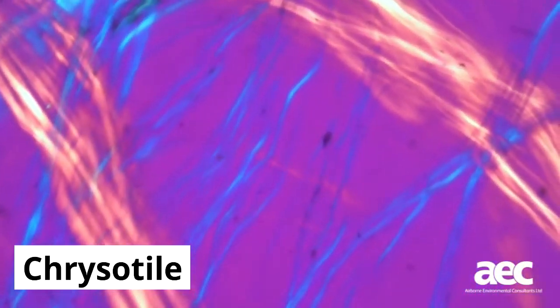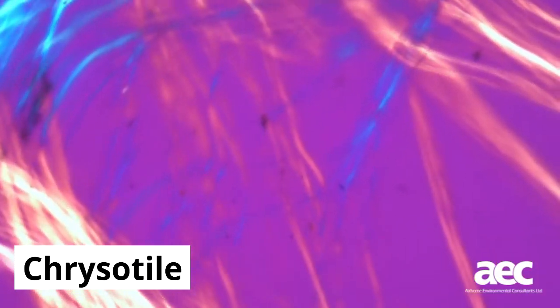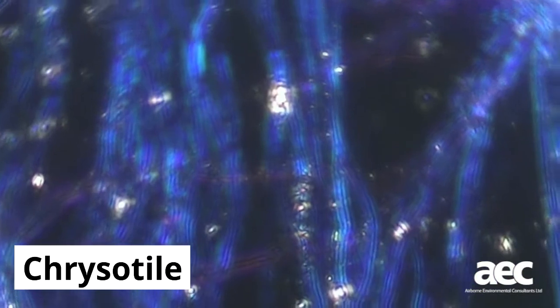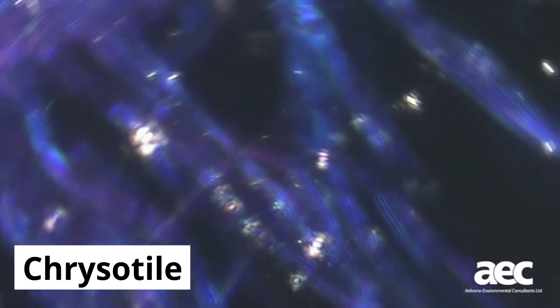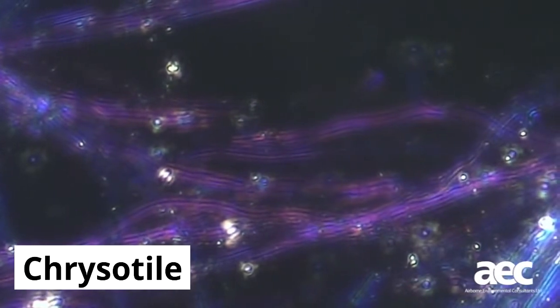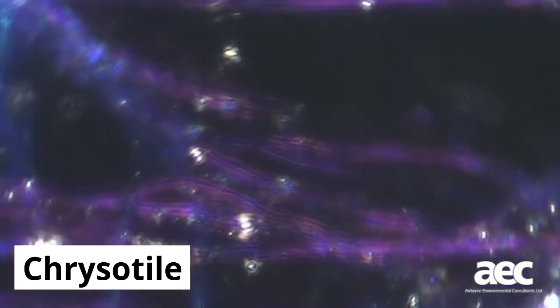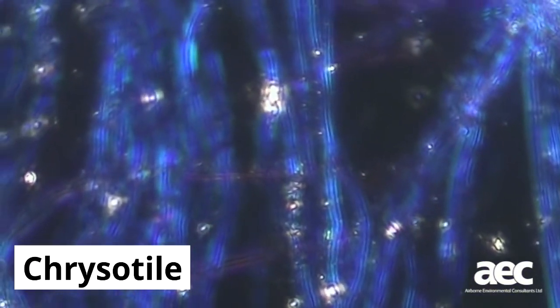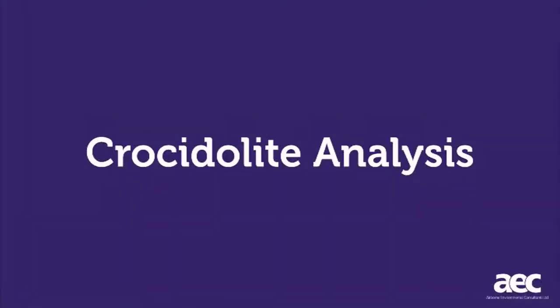Finally, the dispersion staining objective lens is inserted and the fibre colours assessed. If it is chrysotile, the fibre should change from a blue colour to a purple colour as different wavelengths of light are refracted, which we can see it does. Here we see the identification of crocidolite, or blue asbestos, within a sample.